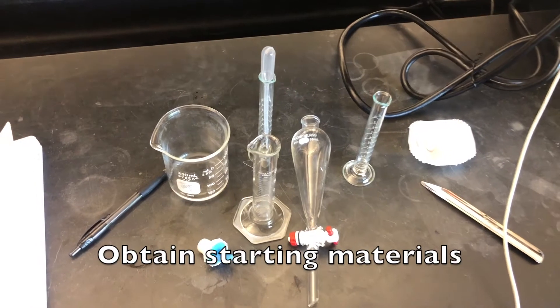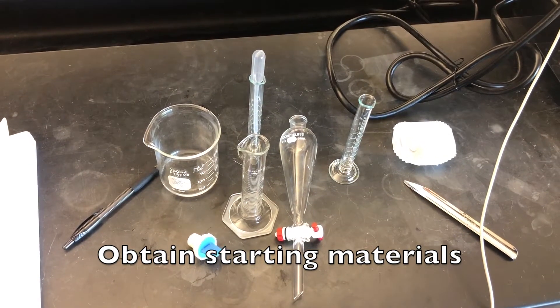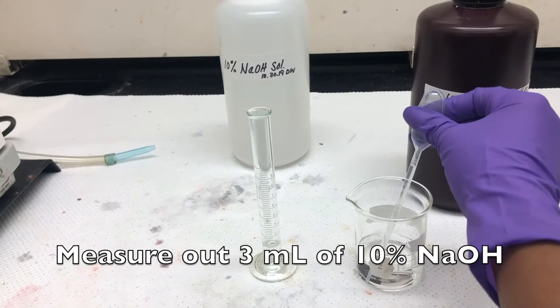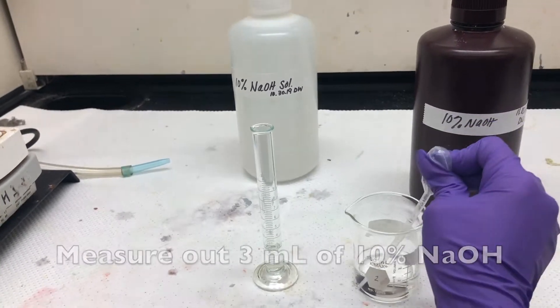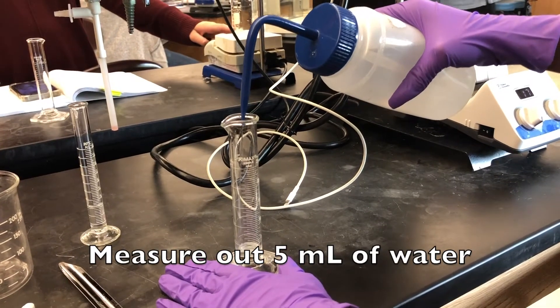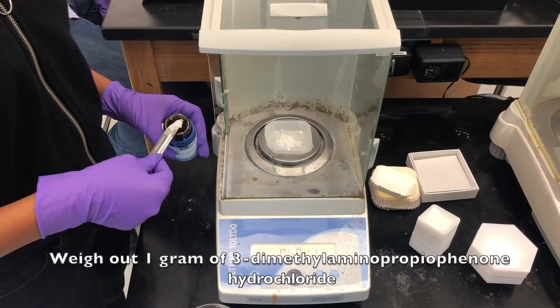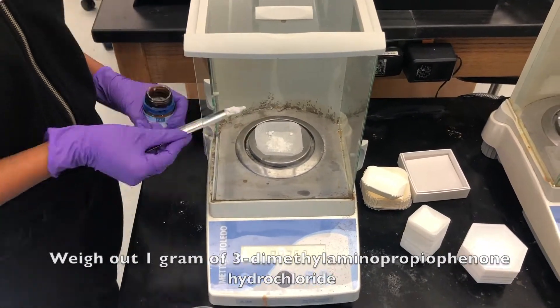Prozac week one. Obtain the starting materials. Measure out 3 milliliters of 10% sodium hydroxide. Measure out 5 milliliters of water. Weigh out 1 gram of 3-dimethylaminopropiophenone hydrochloride.